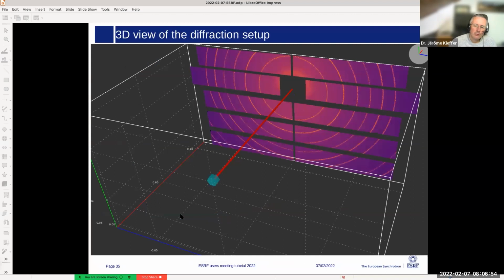this detector, we had the metrology from all 10 panels. We have 10 panels, and we had the position in space from each of the 10 panels, and from this geometry we build the position of each pixel in space, and this is saved in one HDF5 file that is used later on.